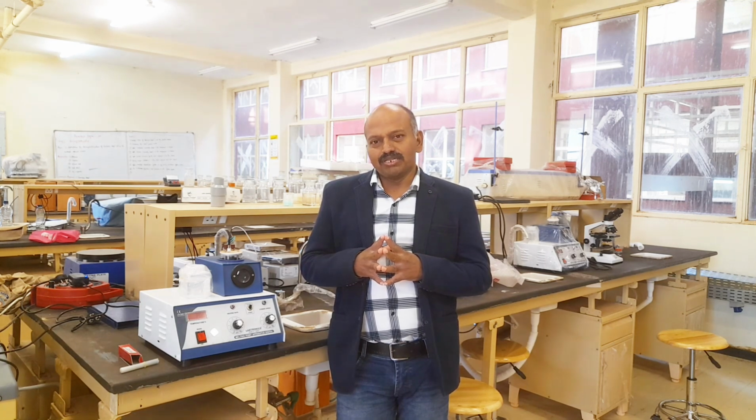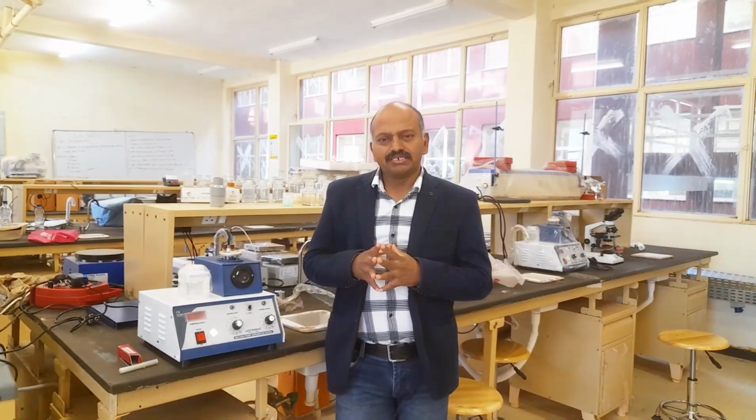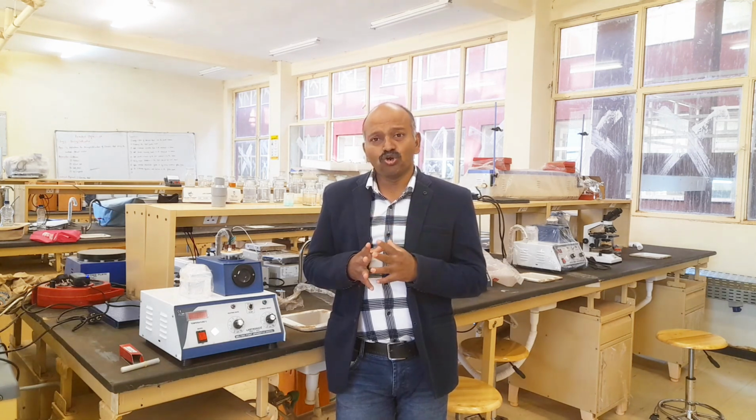Today we'll discuss the instrument called the melting point apparatus. This is a new instrument which is already calibrated and arranged properly. This instrument is meant not only to determine the melting points of organic compounds, but also to determine the boiling points of organic compounds.